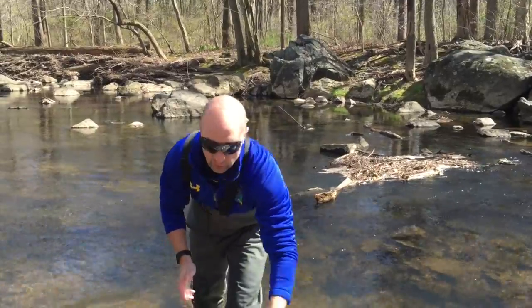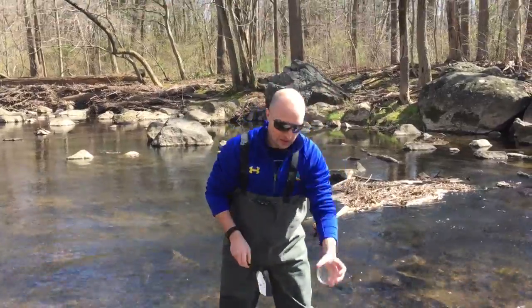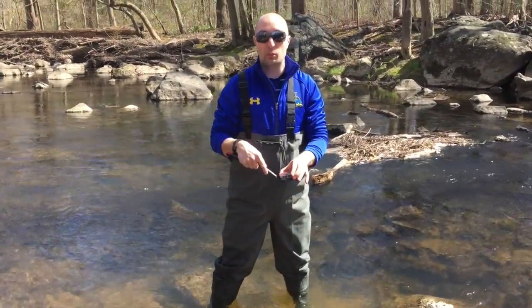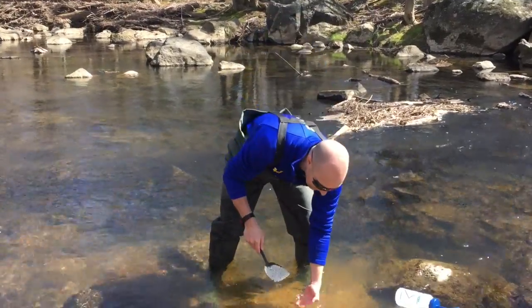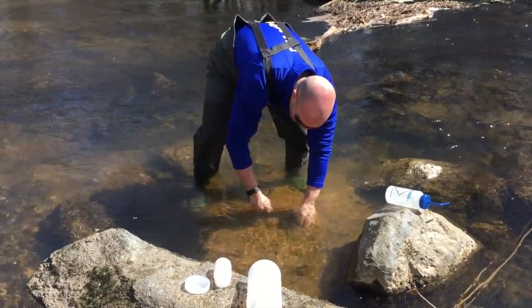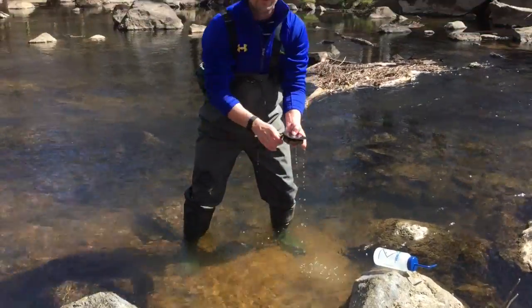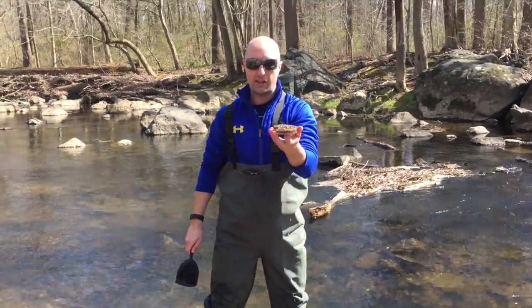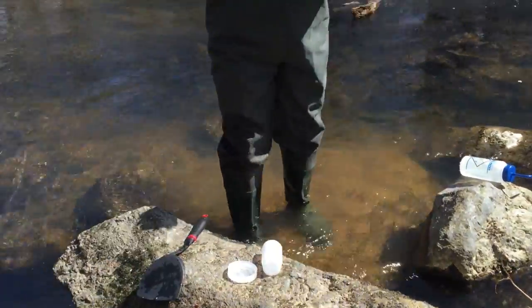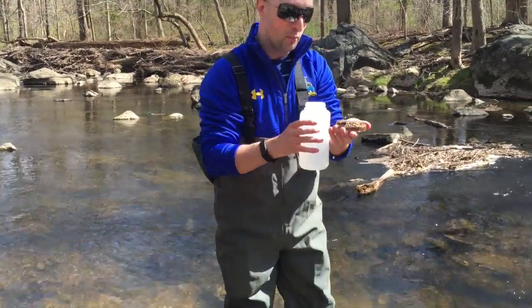First, take your spatula and your petri dish. Place the petri dish into the sand and then slip the spatula underneath it. Then plunge the petri dish into the sand, slip the spatula underneath, carefully invert and lift up. You now have a petri dish that is full of sand.